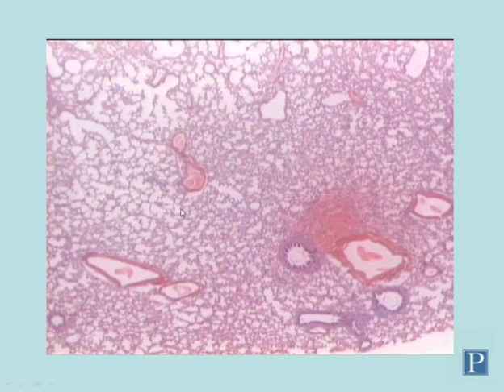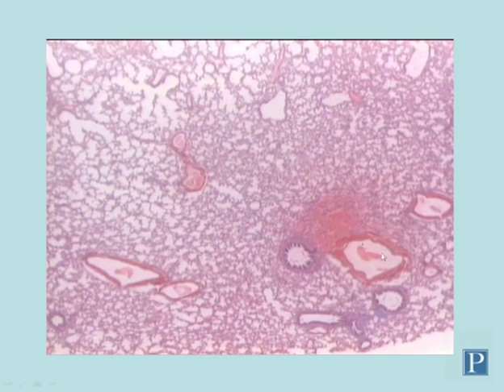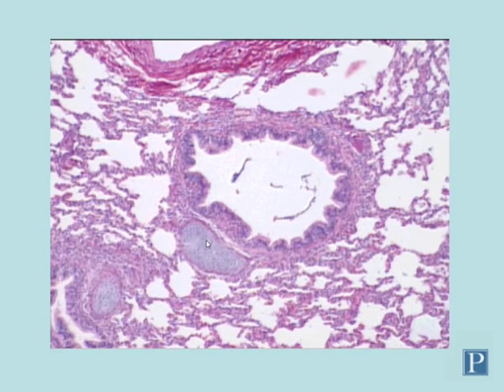This is a low magnification view of the lung. You see a lot of empty space because the lungs draw in a lot of air. You can see some blood vessels at low magnification, a bronchus, and some other larger respiratory structures. Let's take a closer look at some of these.